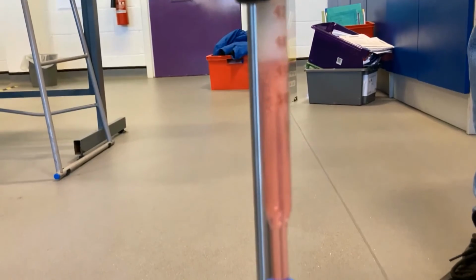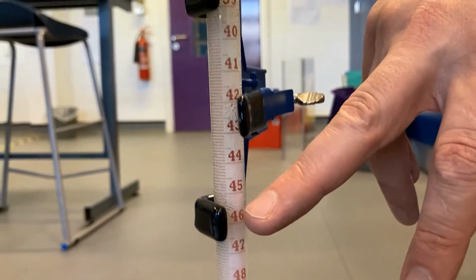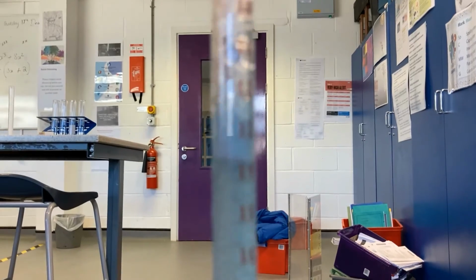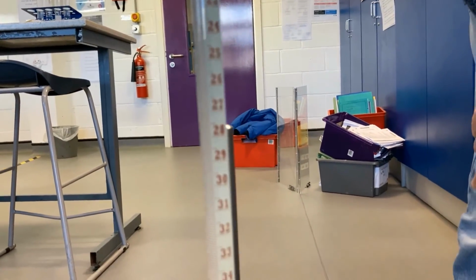So this is pretty much your pH scale, really. Red's down the bottom. Where they're mixing, it's gone neutral. We're neutral along here, and then up here, alkali. And because it's bubbly, it all mixes together. If it didn't bubble, it wouldn't really mix. Take forever.